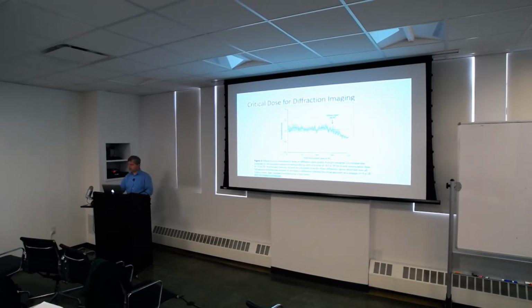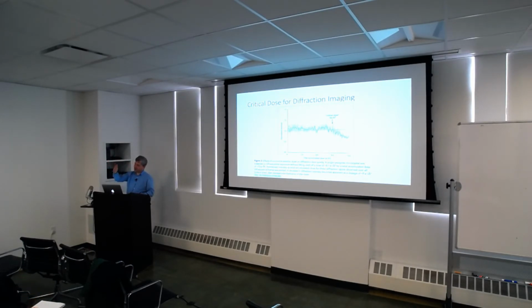We used to be, if you just took one image, quite often people were trying to limit themselves to 20 electrons per square angstrom for the total dose, so as not to destroy the high resolution information, but then it made the thing almost impossible to see. So this is one of the wonderful things that the new cameras give you: to be able to fractionate the dose. You can give it 70, but you can still use only the high resolution information from the first 10 or 20.